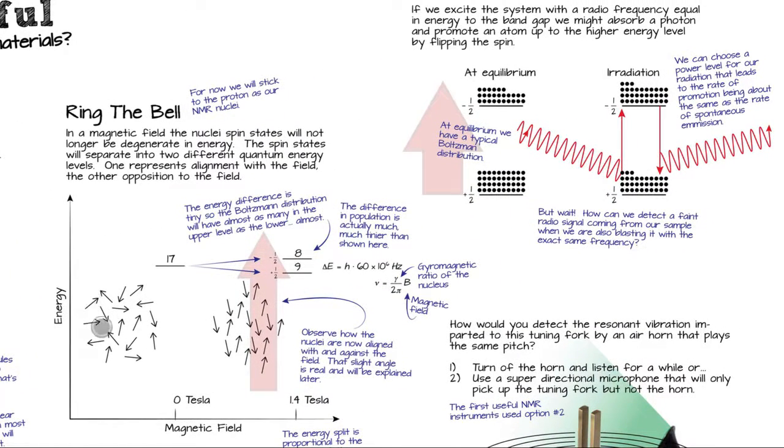If we had a sample in a test tube just sitting around, all the magnetic moments could just point wherever they want. There's no energy difference for pointing one direction or another, so why would they care? What makes them care is an external magnetic field. So I'm imagining here 17 arrows just pointing wherever they want. There's all 17. They're all exactly the same energy level. So of course entropy is the most important element there. They'll just point wherever they want.